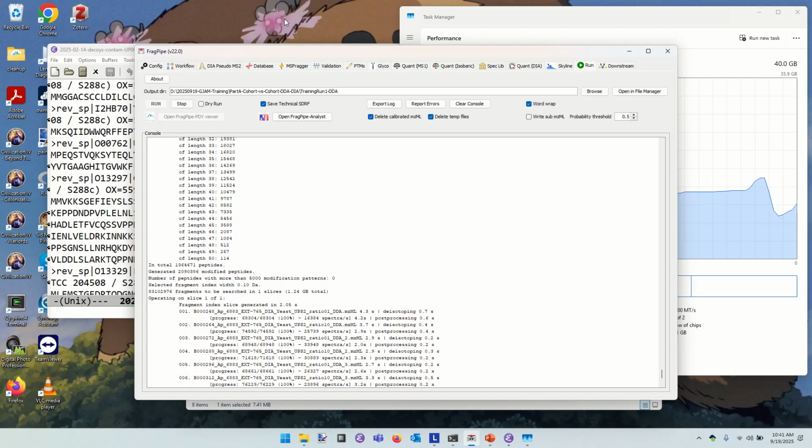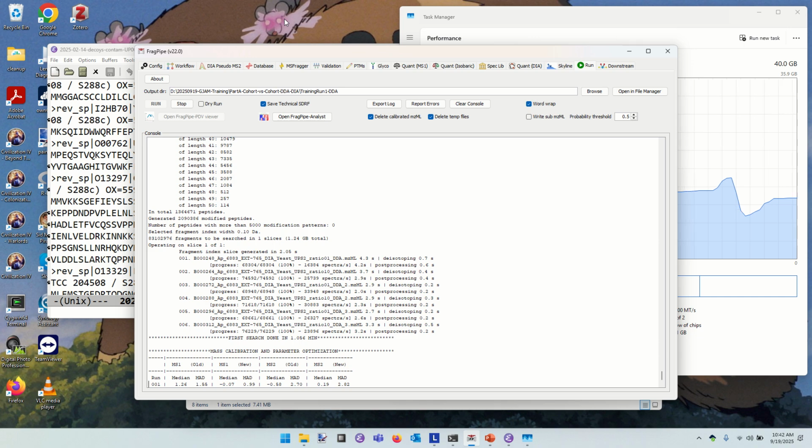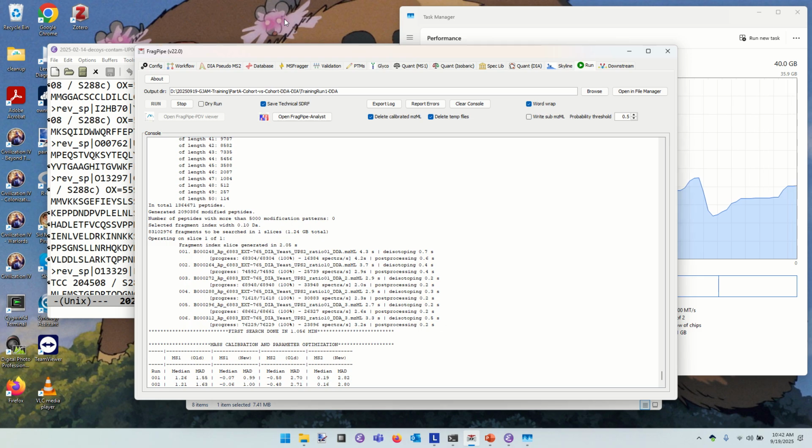There are lots of reasons why you can run out of RAM, but for me, it's almost always the browser. So I just put run again. Perfect. It probably complained about how there might be files in the directory, but that's fine. Okay, you can overwrite them. So it's doing a pre-search in this first case.